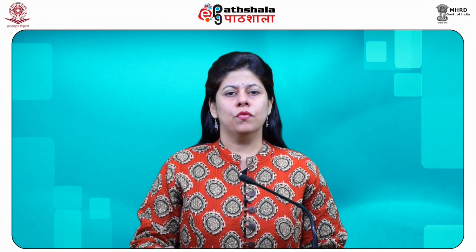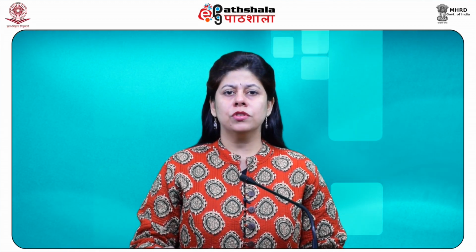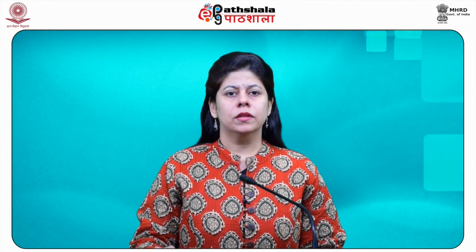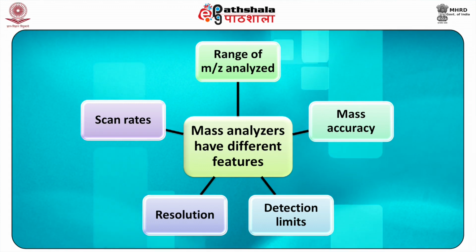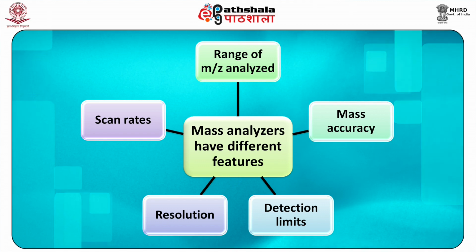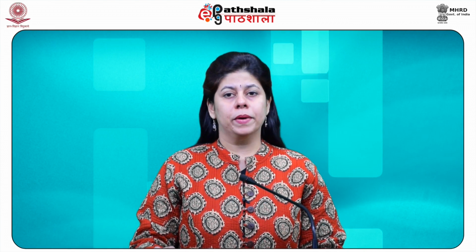Resolving the ions which are formed in the ionization source according to their mass to charge ratio is the major function of the mass analyzer. These mass analyzers have different features including the range of m/z analyzed, the mass accuracy, detection limits, resolution and scan rates. Analyzers can be considered as continuous or pulsed.